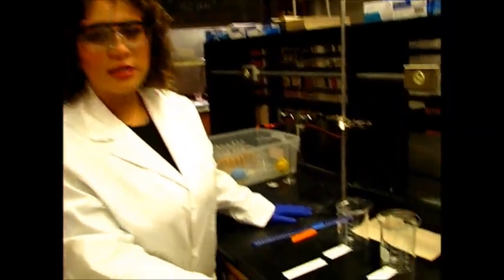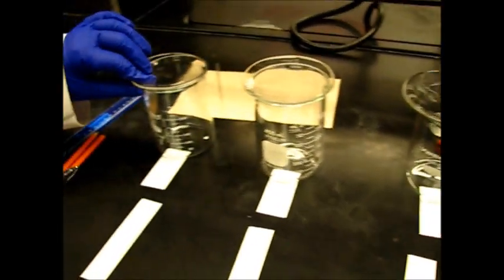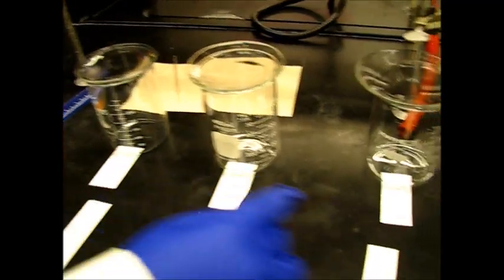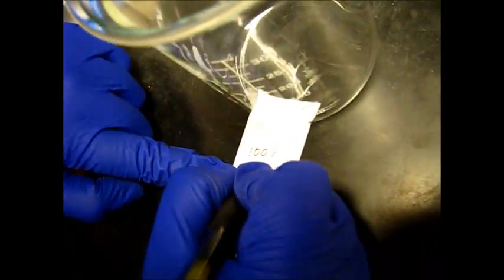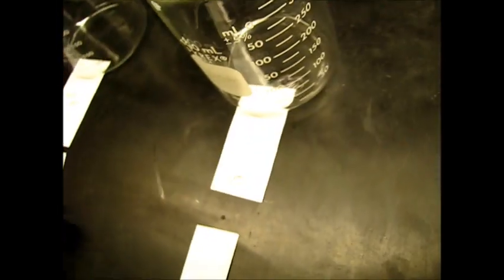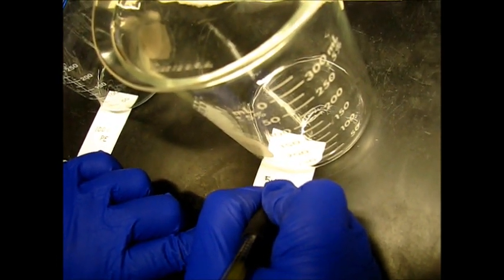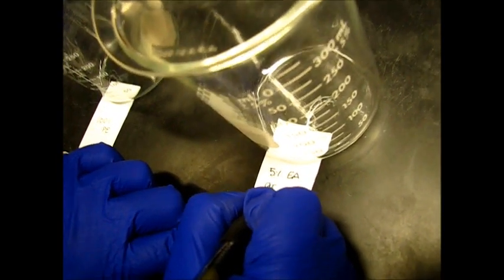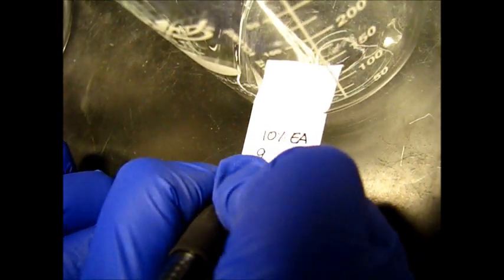Here we have our experiment set up. We have the three beakers with the watch glasses on top and we have to label them to know which one they will be. Our first one will be 100% PE. Our second one will be 5% EA and 95% PE. And for the third one we will do 10% EA and 90% PE.